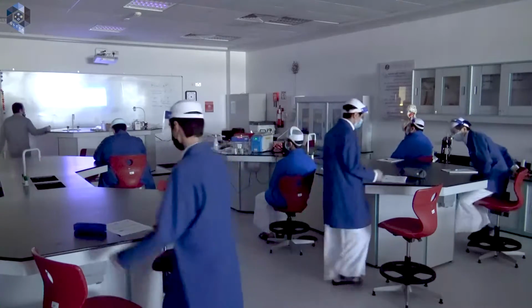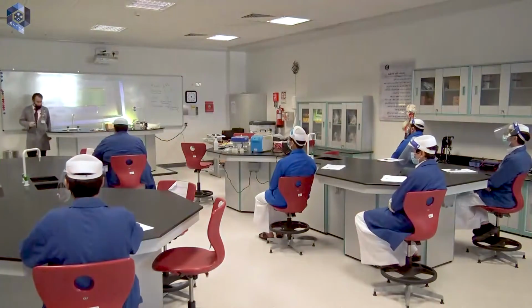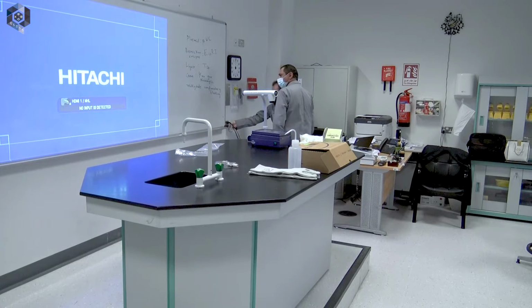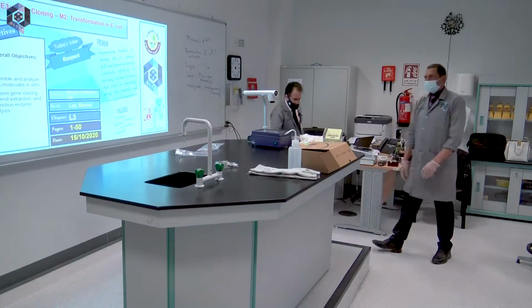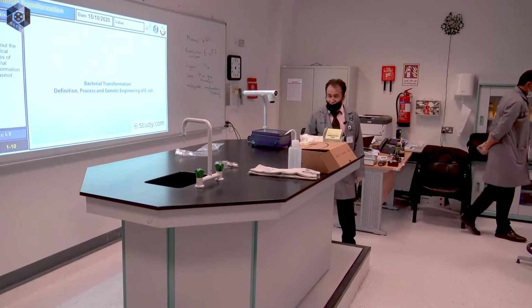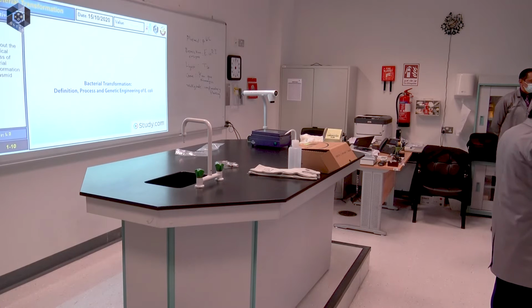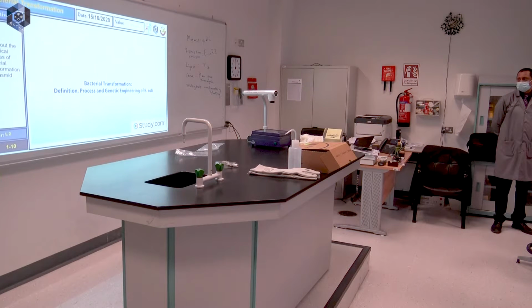Now, we will resume with the work in the lab. To do so, we will review quickly the procedure. So again, after we have visualized the results of the electrophoresis, I will invite you to watch a short video about the transformation process to recall how it is implemented. Then we will start with the process itself, okay?